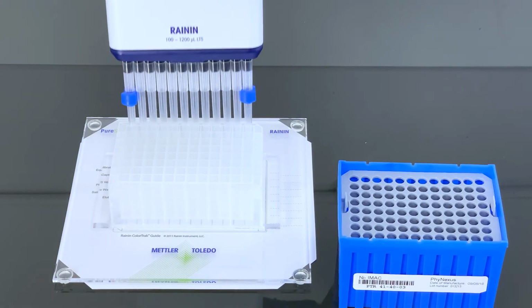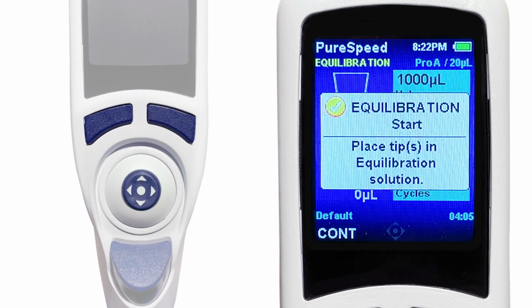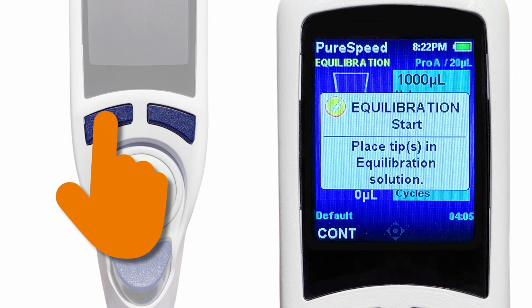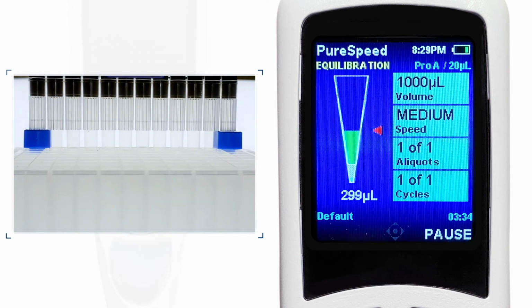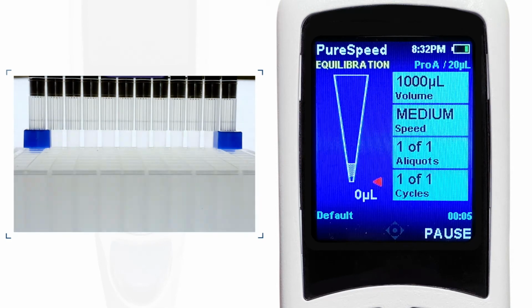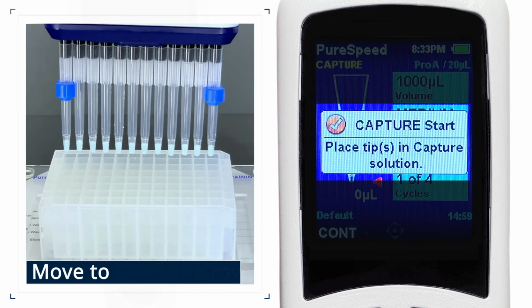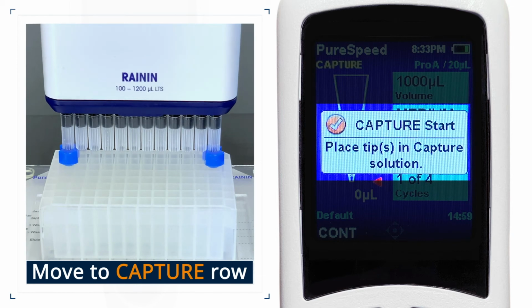Then place the pipette with tips in the first row of the deep well plate. The system is now ready to start your selected method execution. Press the left button under the screen to select Continue. The pipette will now start to cycle through the pipetting protocols. Once the equilibration is complete, the system will ask you to move the tips to the capture solution row. Then move the pipette with tips to the capture row.